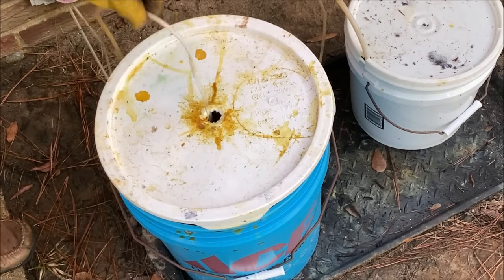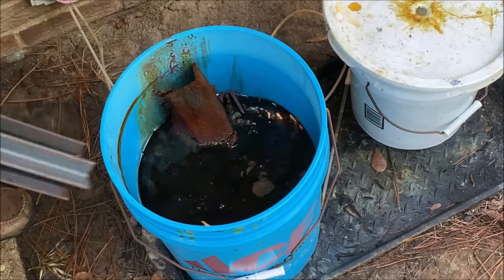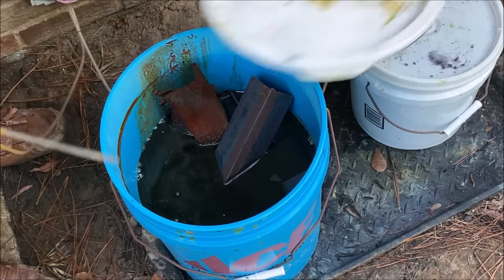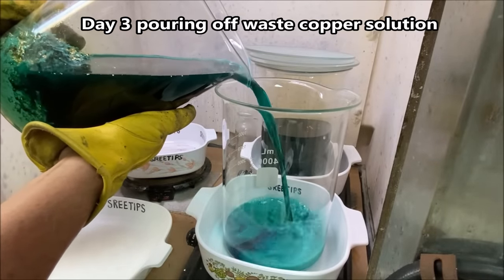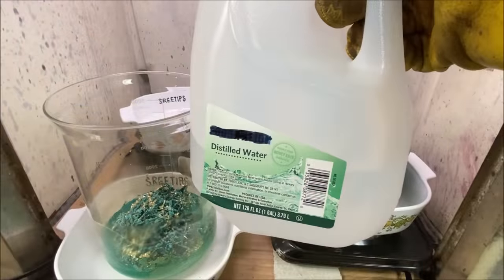I just dumped another beaker full of waste copper solution into my waste treatment bucket. So I'm going to add some more pieces of angle iron here to make sure that we get all of the copper cemented out of this waste solution. Here we go, we're gonna start on bottle number 3 of the nitric acid.